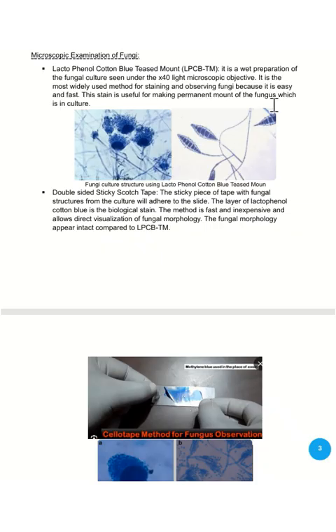It is the same as the lactophenol, but this one is proved to keep the spores intact and the hyphae intact, even their arrangement, unlike the lactophenol cotton blue, because there you use the inoculation loop to take from the colony, and this might disturb the colony or disperse the spores.